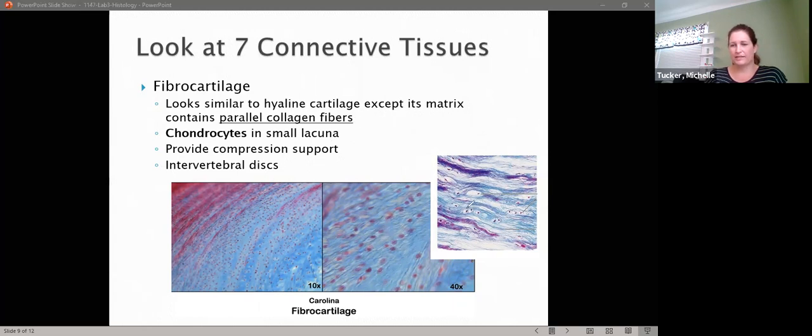The chondrocytes are kind of tiny, so they're a little bit harder to see. It is the only slide specimen we have that's staining blue, but normally don't try to use color too much, though in this particular lab it's a little bit helpful. Collagen tends to be that pinky color, and elastic is that dark, intense purple.